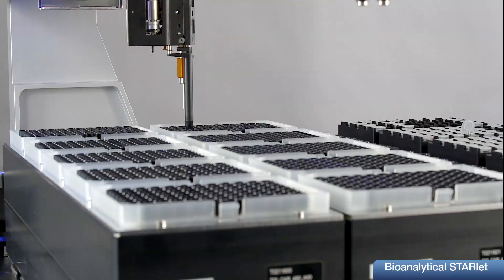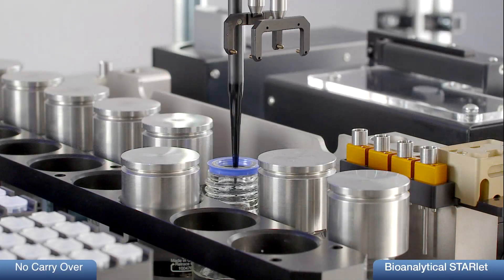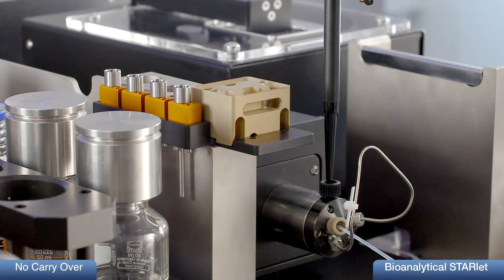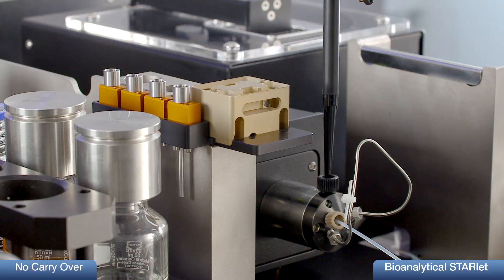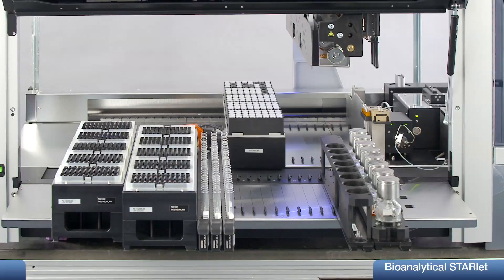All injection steps are done with disposable tips to avoid carry-over. Sample injection with 50 µL tips is done on a different height inside the injector than the wash with 300 µL tips, which ensures no carry-over even when using a simple wash procedure of the injector.